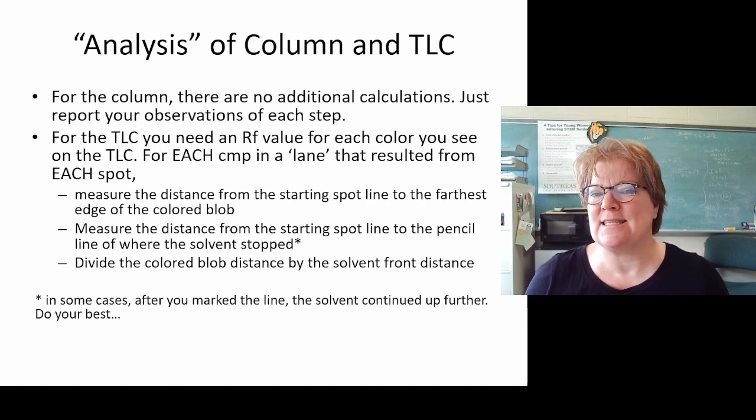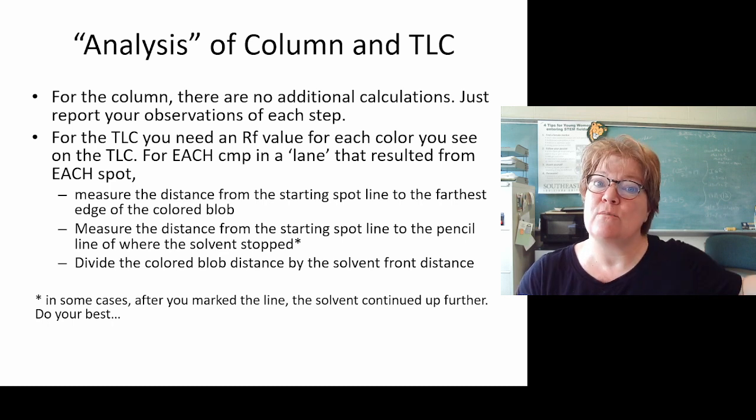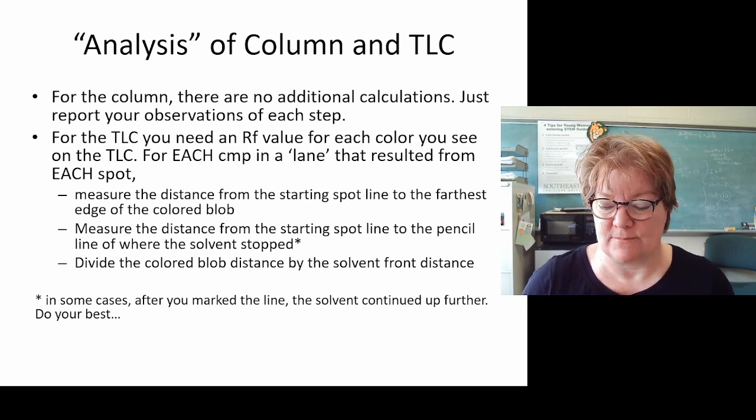Again, I explained that this is not an optimized TLC and there are issues with it. You'll talk more about how to optimize a TLC and design it in organic, but we get the idea of how to run a TLC.